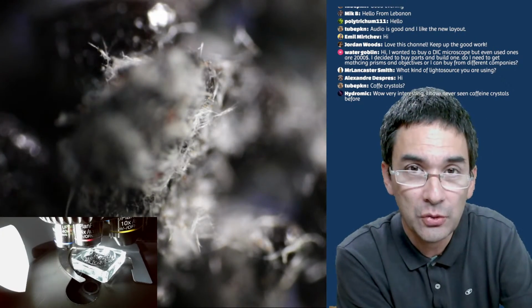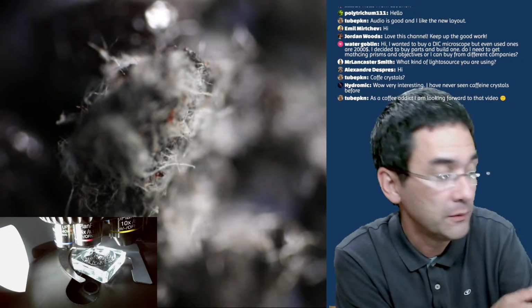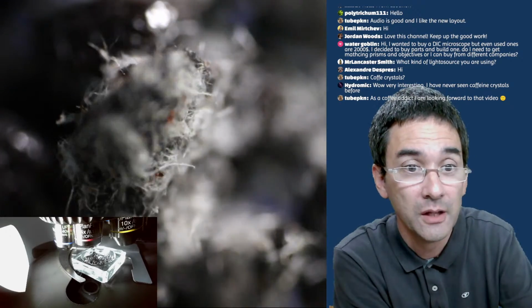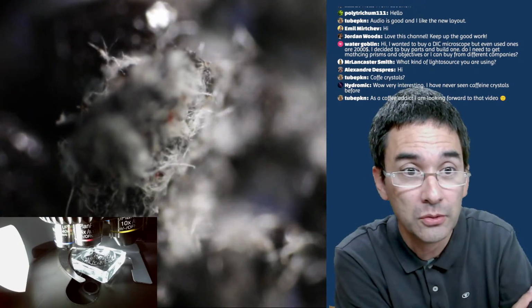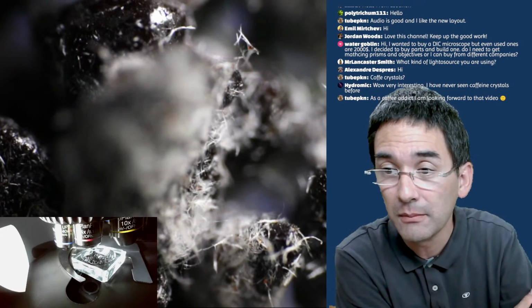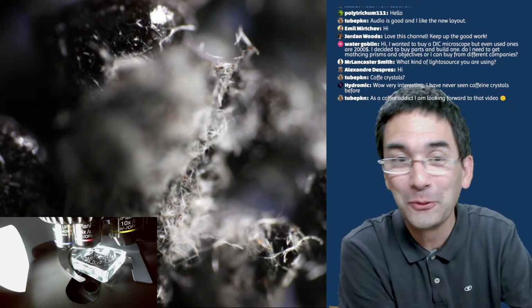And that's basically, I use those caffeine crystal capsules as a reference. But for me, this is also the first time that I saw this, because I couldn't believe this myself. So I'm quite certain that this must be caffeine. I could not imagine anything else. Yeah, the crystals kind of look the same. Yeah. So as a coffee addict, I'm looking forward to that video.